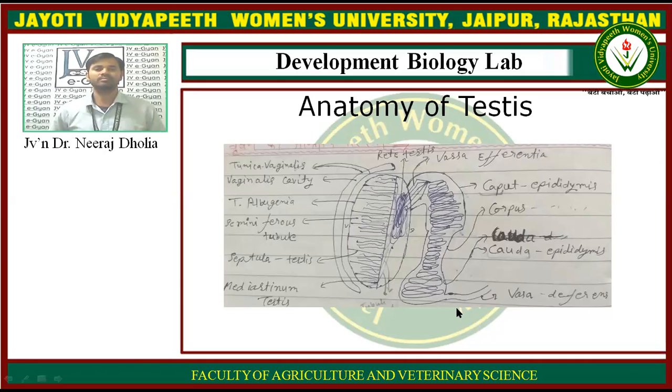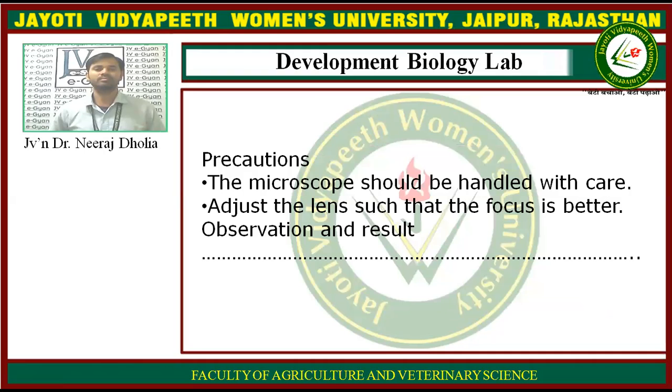So the precautions you need: you should first clean the microscope stage, the lenses, and the slide, and you focus optimally. For observing through the microscope, the focus is the most important thing.